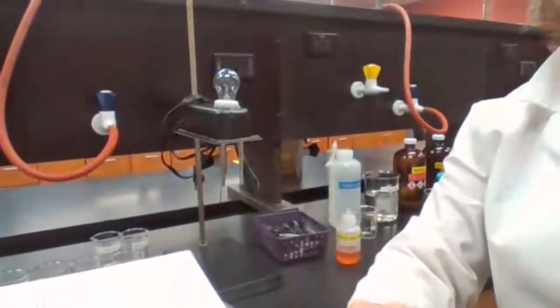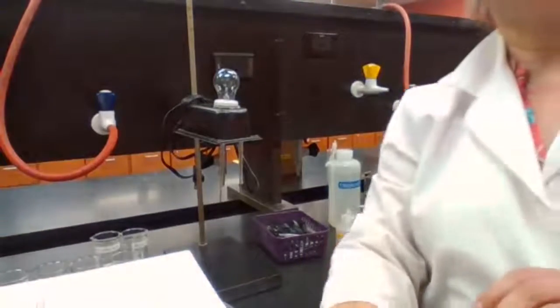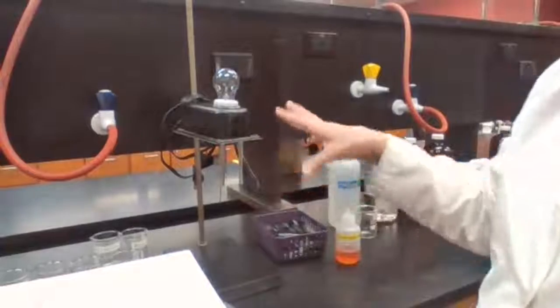Whether an electrolyte is strong or weak, based on the experiments we are doing today, will be shown by how it lights up the light bulb of the conductometer. We have a very simple setup for the conductometer.